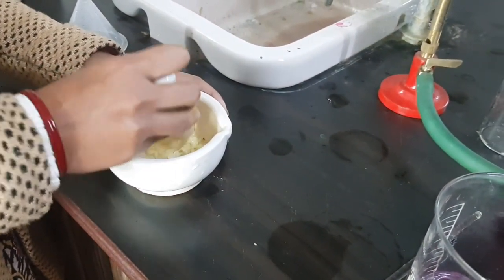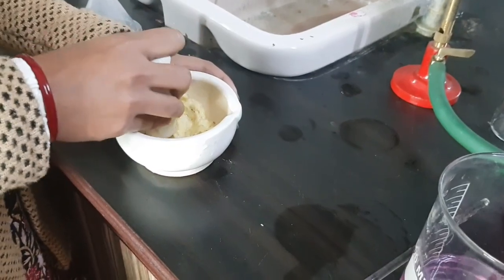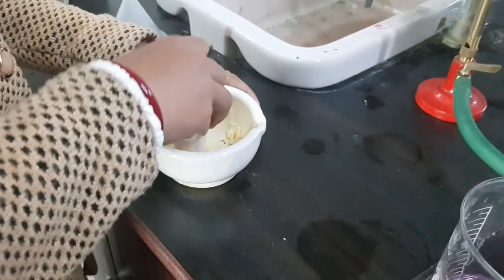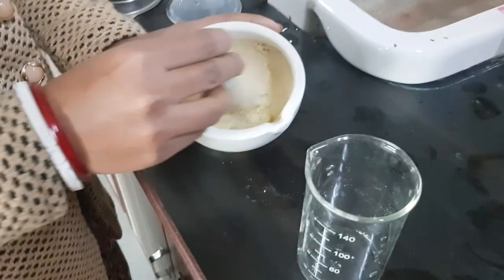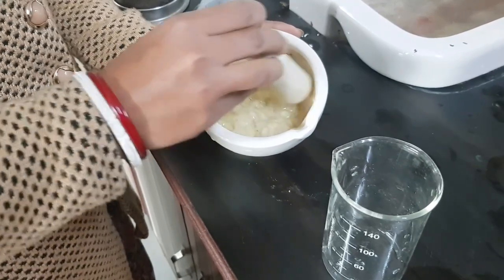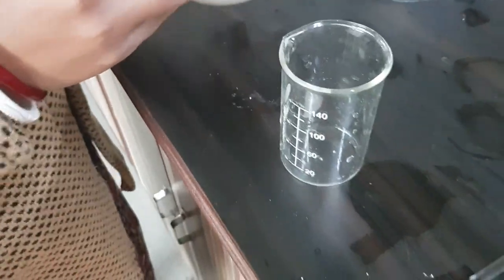Then put some distilled water in the smashed banana. The smashing of the banana with some distilled water is done. Now we will take this extraction fluid in a beaker.